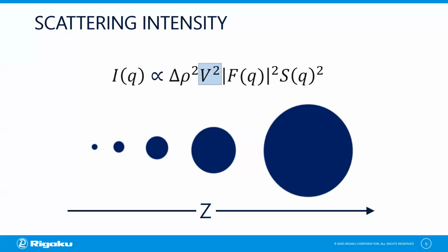And you may not see scattering contributions from very small things. And likewise, if you have mixtures of monomers and dimers and higher order oligomers, then you're going to have the scattering profile of all of these things put together. So that may be helpful in your case, but if you want to look at a single entity, then you have to make sure that it is truly a single monodisperse entity. And you can do that by perhaps doing some dilution experiments, and we'll talk about that in a minute.